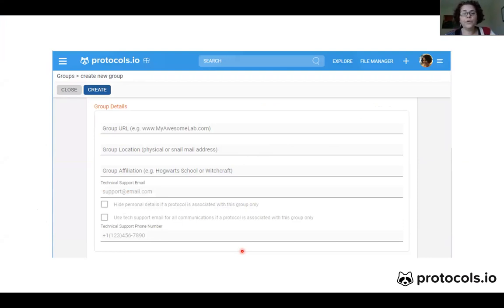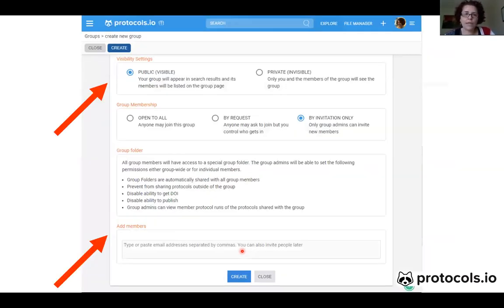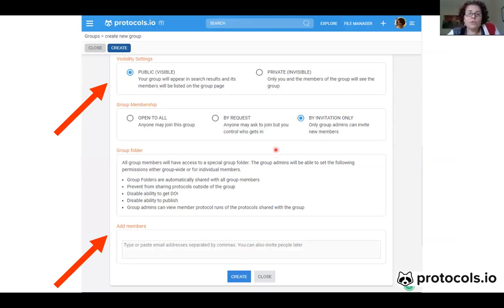You can also fill in the group URL, the location, and many other things that you can customize. This part is pretty much self-explanatory, but what I want to focus on is the visibility settings. Here is where you can choose if your group is either public — visible to everybody — or private and invisible.